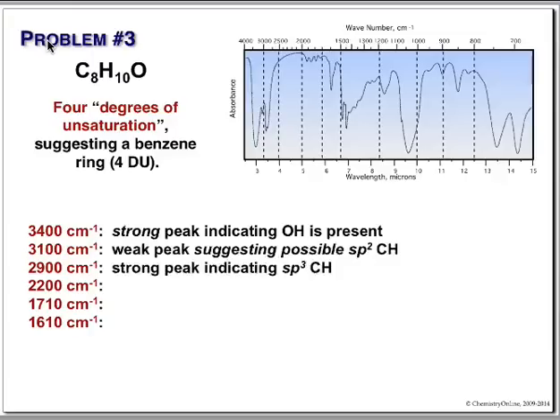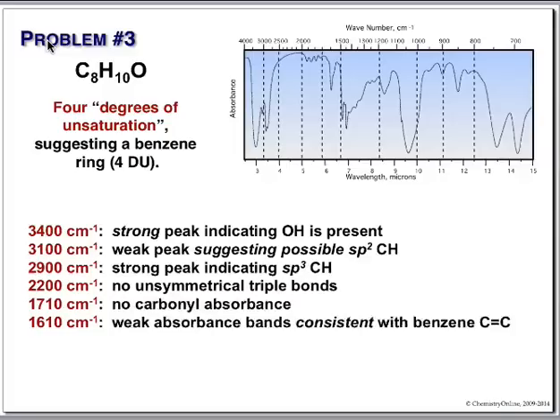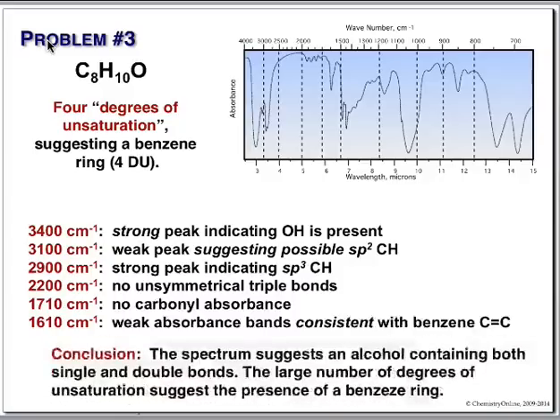We have no aldehyde. Triple bond, nothing. Carbonyl, nothing at all, is there? No carbonyl band. And finally, 1600 down to 1450, we see at least three bands in there. That's consistent with benzene carbon-carbon double bonds. So this looks like it has a benzene ring, and it has an OH.